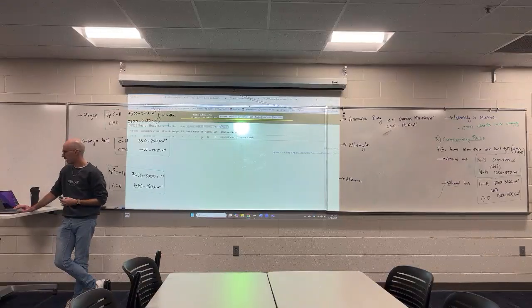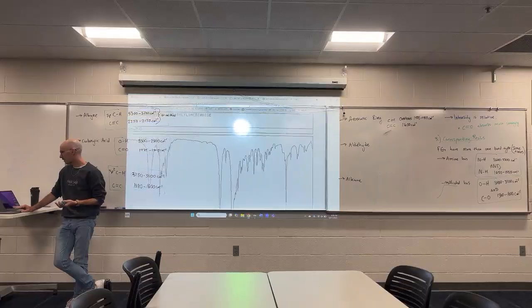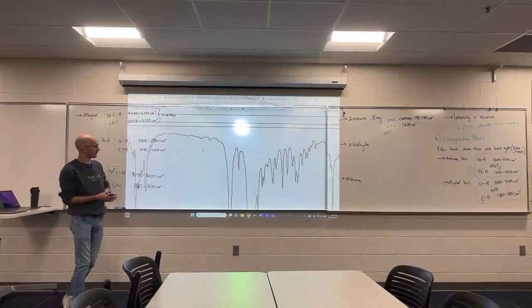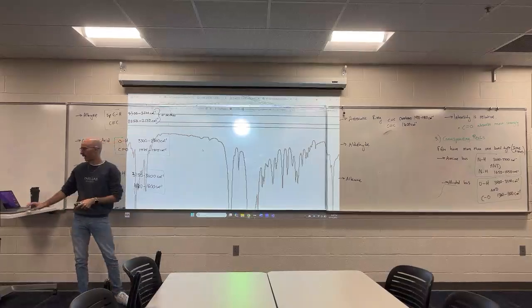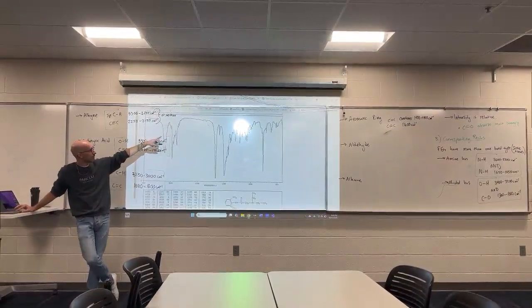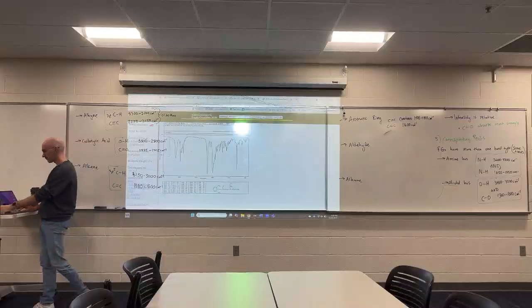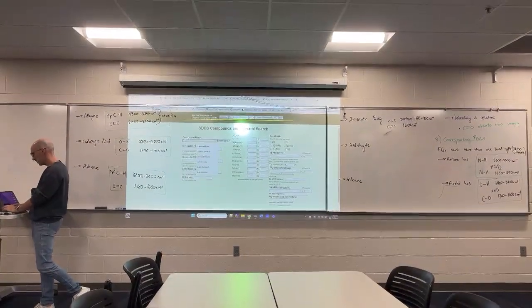Overtones are kind of like a resonating frequency of the aromatic ring. I think that you might be able to say that these are aromatic overtones. They're in the right range for it. They're fairly weak, but they're actually not as many as I would expect.